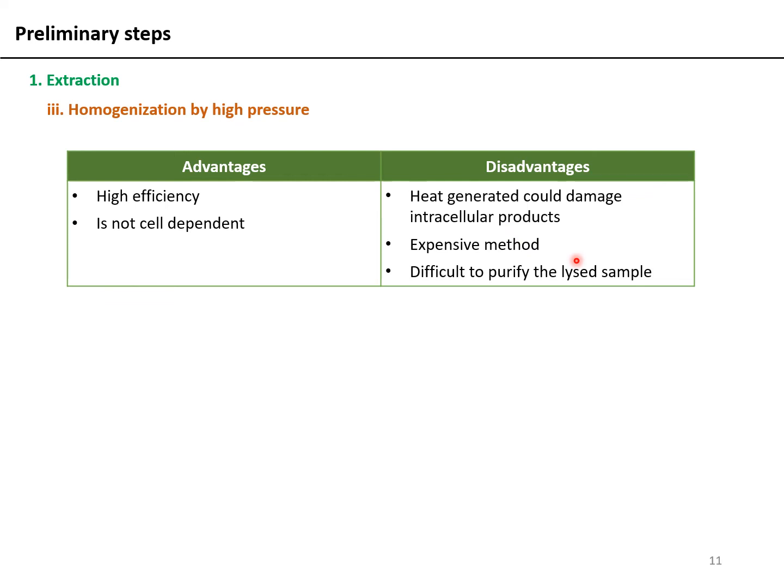It is an expensive method because you need the French press equipment and you can't just do it without it. And it is difficult to purify the lysate samples. Well, it is not always difficult. Sometimes it might be difficult, but not really. This particular disadvantage, we can put it aside and it can be easily circumvented.